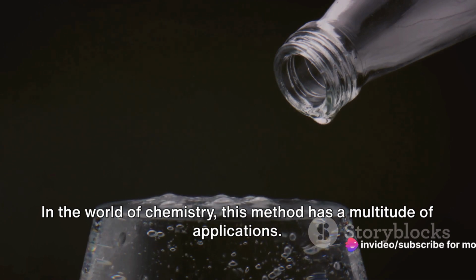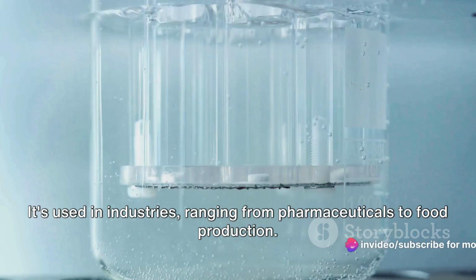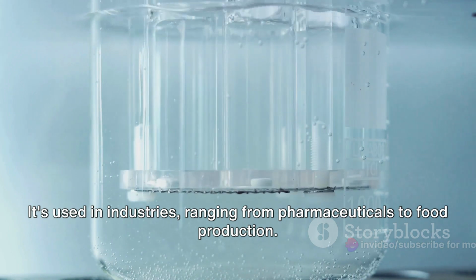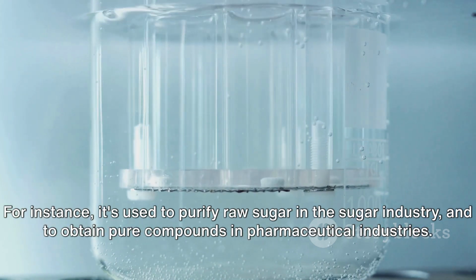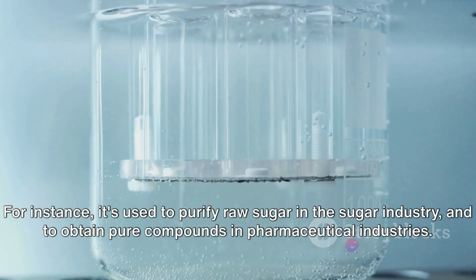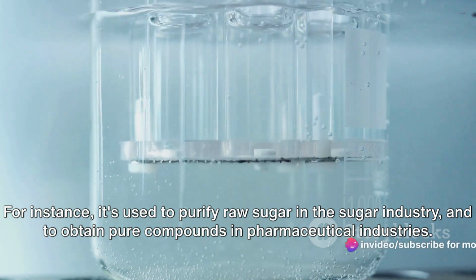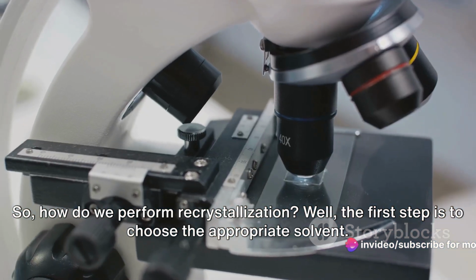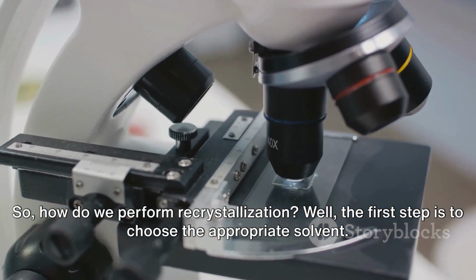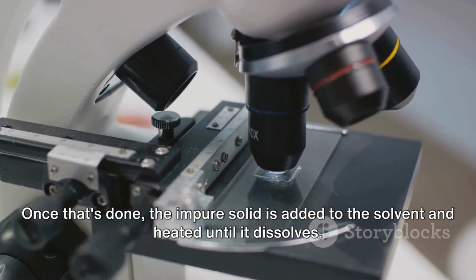In the world of chemistry, this method has a multitude of applications. It's used in industries ranging from pharmaceuticals to food production. For instance, it's used to purify raw sugar in the sugar industry and to obtain pure compounds in pharmaceutical industries. So how do we perform recrystallization? Well, the first step is to choose the appropriate solvent.